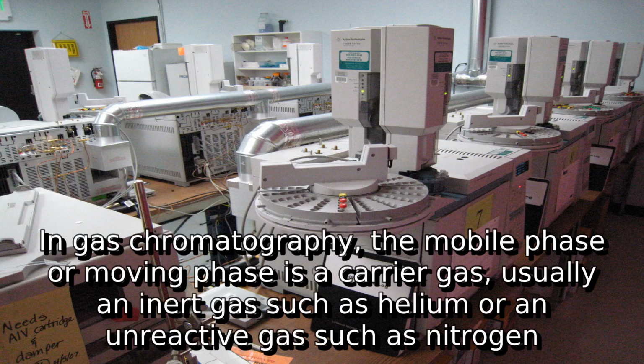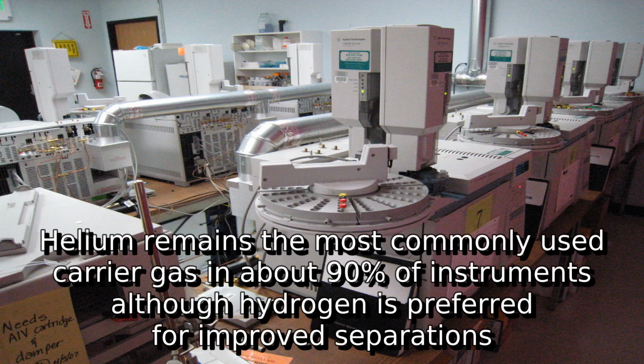In gas chromatography, the mobile phase or moving phase is a carrier gas, usually an inert gas such as helium or an unreactive gas such as nitrogen. Helium remains the most commonly used carrier gas in about 90% of instruments, although hydrogen is preferred for improved separations.